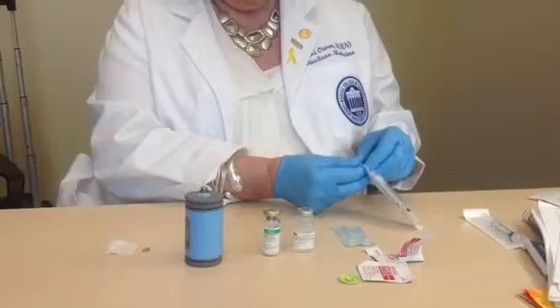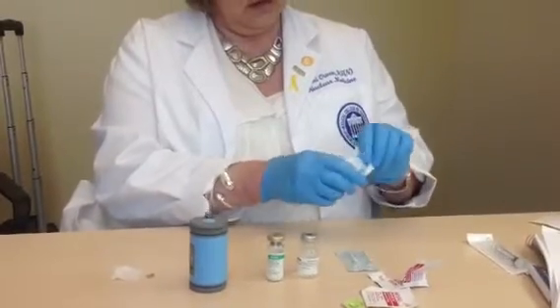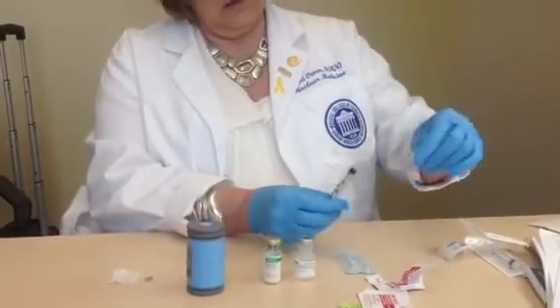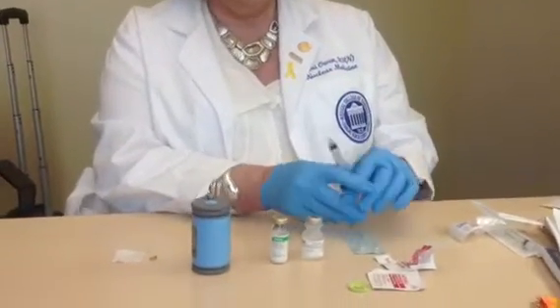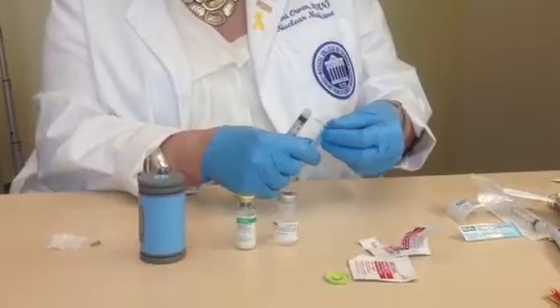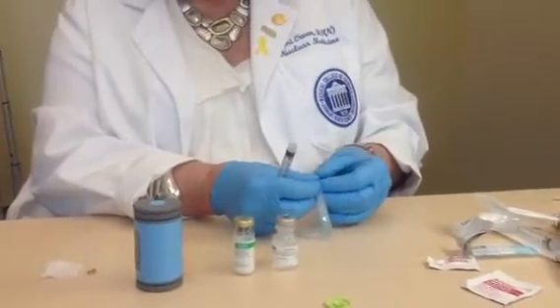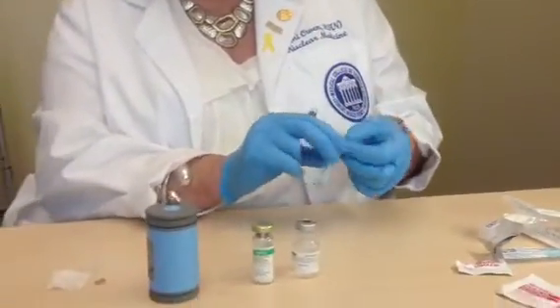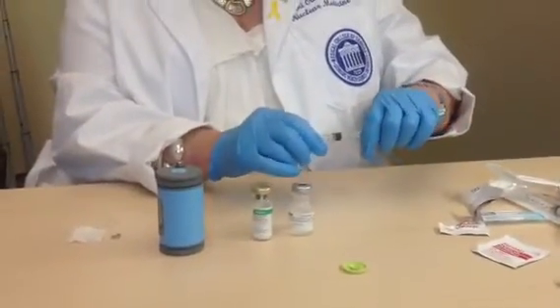syringe. Let's see here, it should be opening at the top, but I'm not seeing it do that, so we're going to pop it this way and open it. We're going to take the cover of the syringe off. We're going to break the seal. This is a 3 cc syringe we have. Then we're going to place our needle on the top of the syringe. Here it is. That's what I'm looking for. We peel it open. We do not touch the needle at the moment. And we put that on like that.